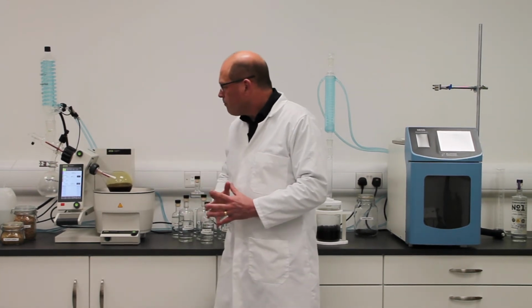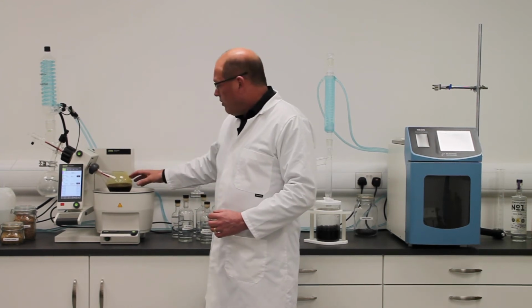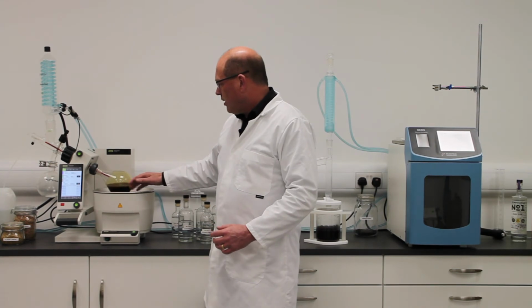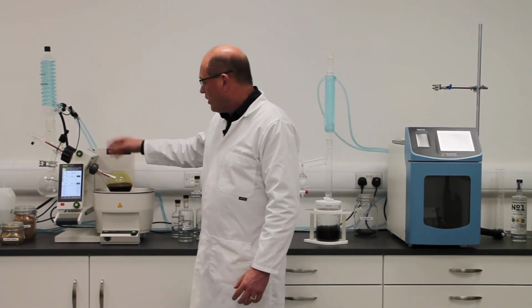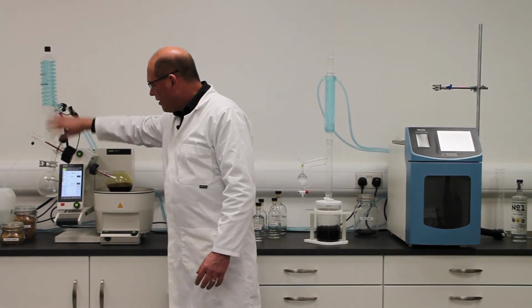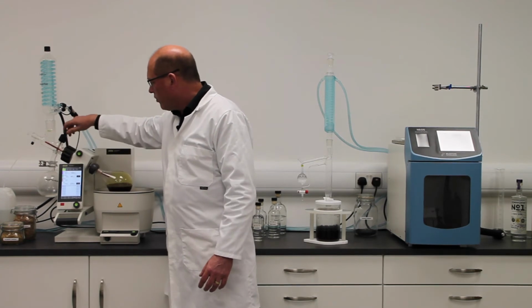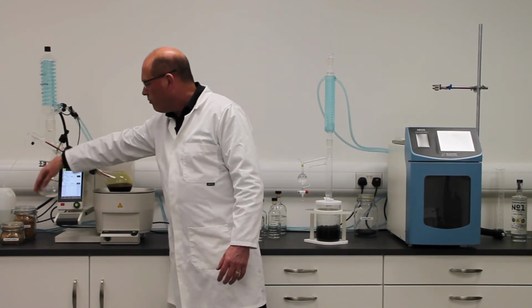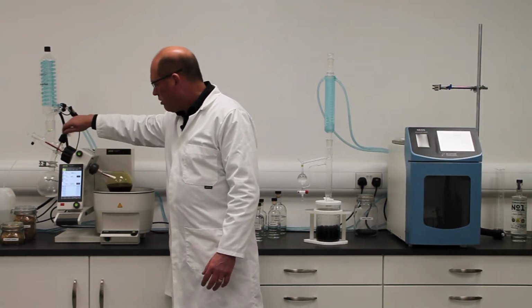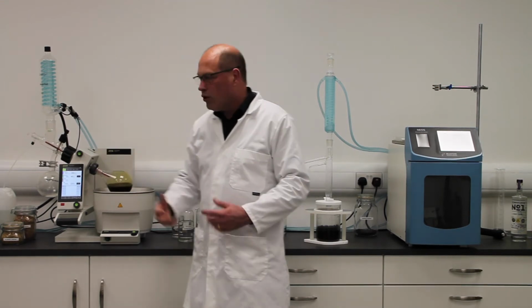from the juniper. So what we do now is drop it. This would normally be in the water bath, heating. The ethanol water would heat up into the condenser, condense down, and it would end up in the receiver. Once the receiver was full, you can close this off, remove this receiver, empty it, put it back on, reopen this, so you can continue to take out more and more ethanol.